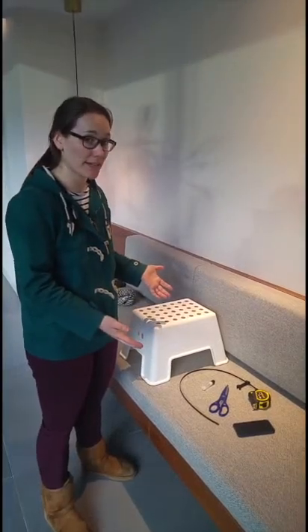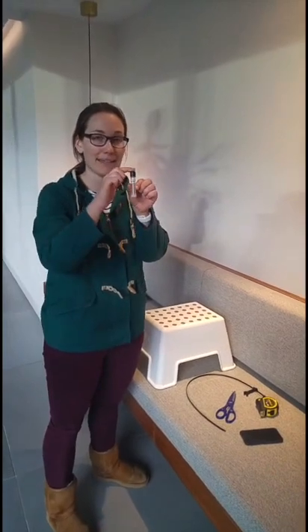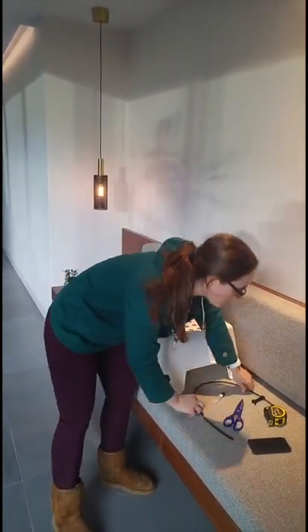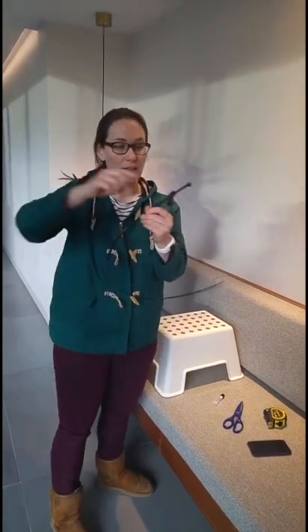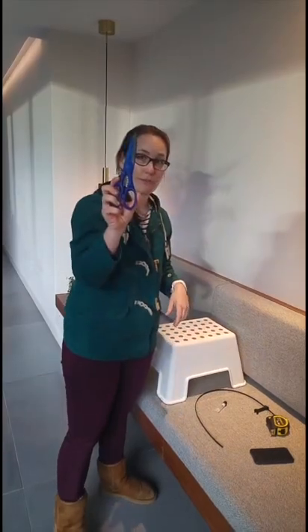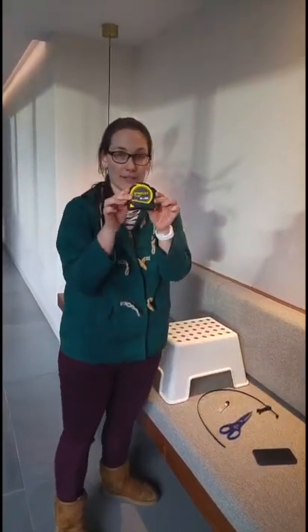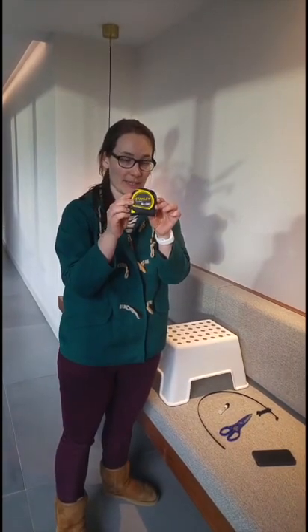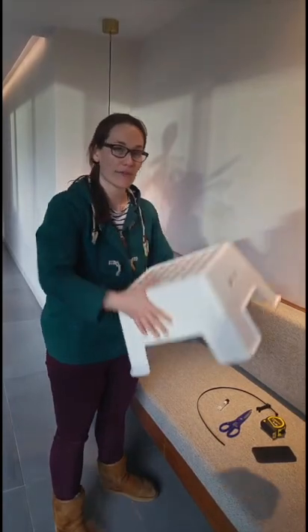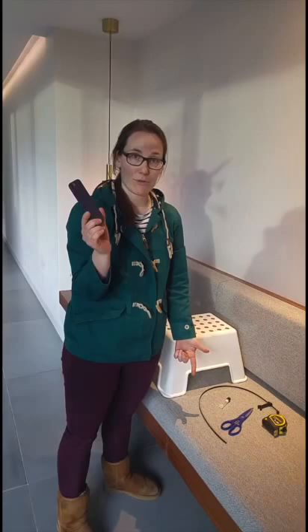This is our citizen science monitoring kit. We have the diffusion tube — the black end is the top and the clear end is the lid. We've got the cable tie with the post to put the diffusion tube into, a pair of scissors to trim the cable tie, a measuring tape so you can check how high you're putting the tube, a step stool so you can reach easily, and finally your phone to take a photo and to fill out the form.